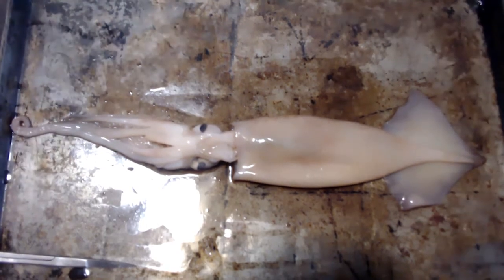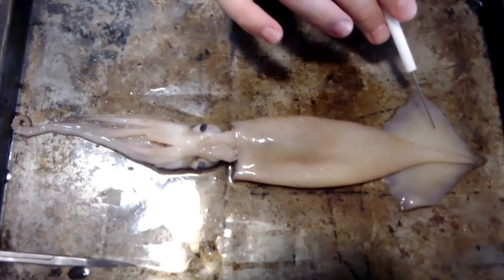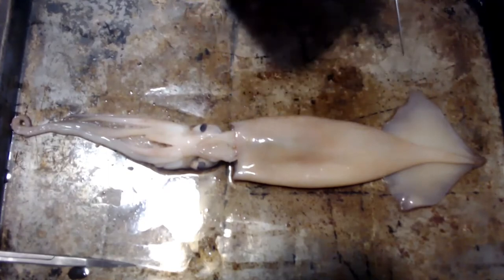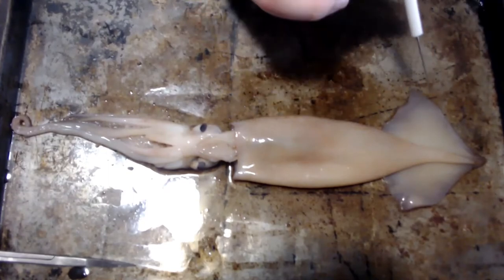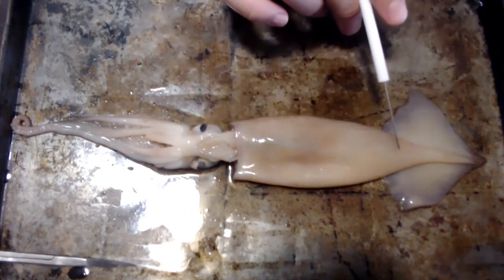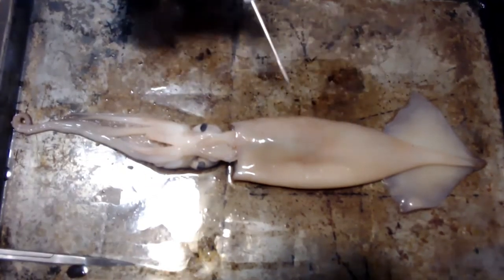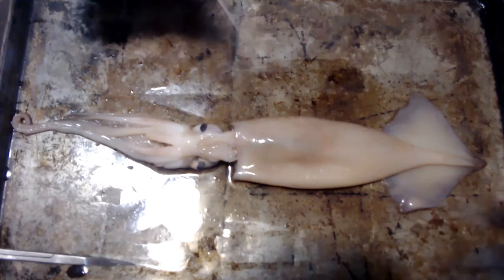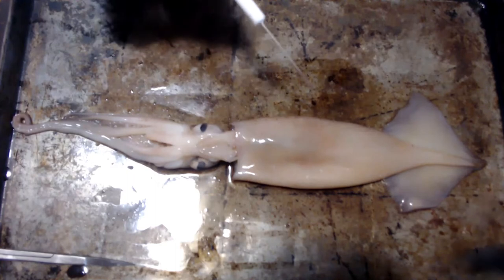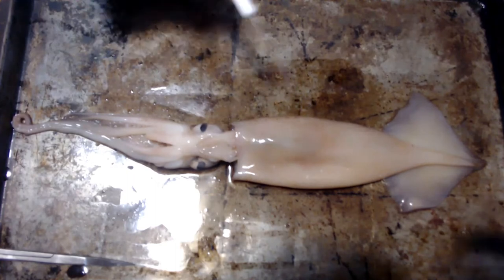Let's look at our posterior side right here. This is where the mantle is, and these are where our two fins are. These fins are what help the squid move in different directions — forward, backwards, side to side. And we have our mantle here. This is where all the major organs are — the vital organs, the hearts, all that jazz.